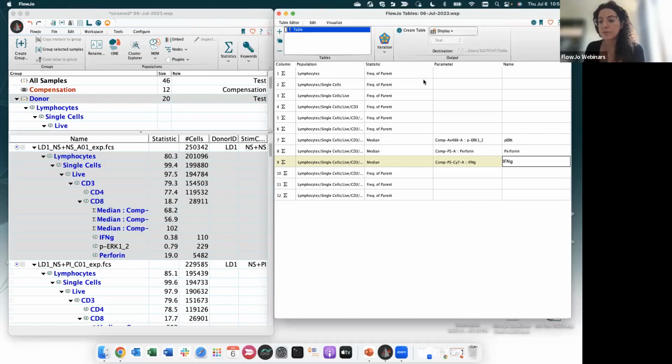First, check your samples by iterations by samples. Define where you want to have your gate, and then create the batch. The batch should be the final step whenever everything has been checked and controlled.